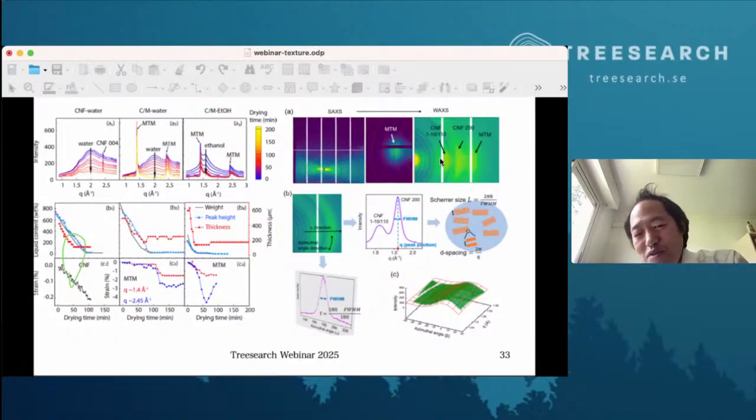With the X-ray beam parallel to the mat, you will get this kind of oriented pattern. So you can retrieve the peak position, how it is aligned, the intensity, and so on. Very often people tend to do integration because there is software to do azimuthal integration of intensity. But then you will lose information, because CNF diffraction and montmorillonite don't have the same azimuthal intensity distribution. If you integrate along the whole azimuthal axis, you will lose this information. So what we did is to fit all the data points directly in two dimensions with a function to deduce different parameters.